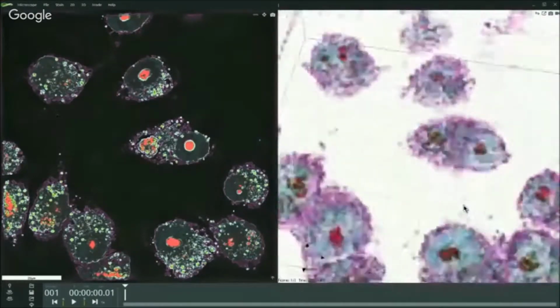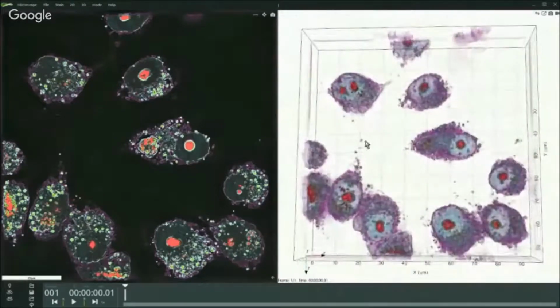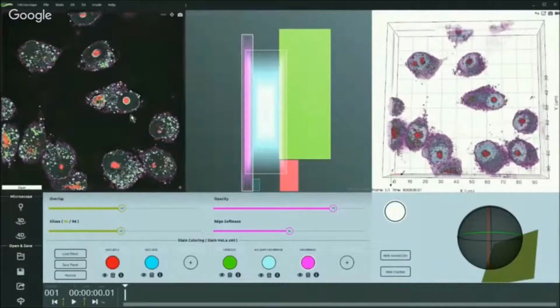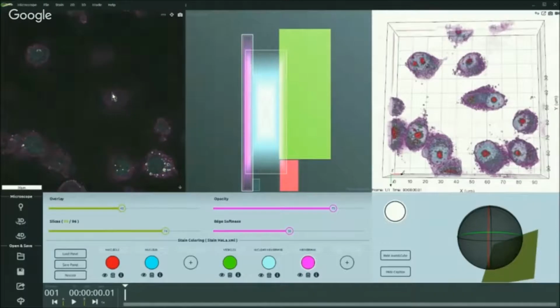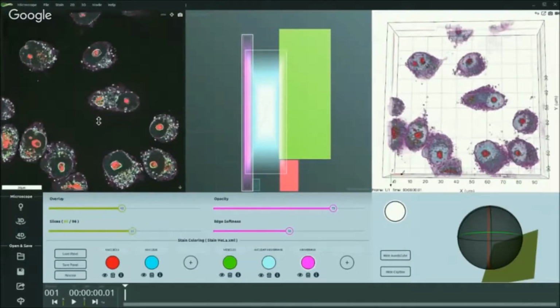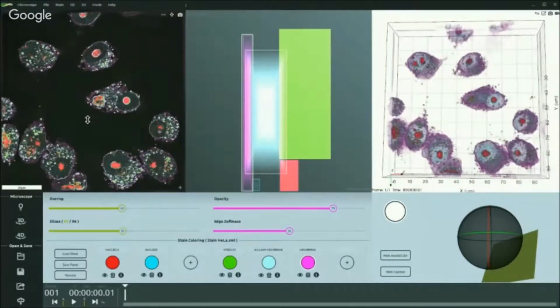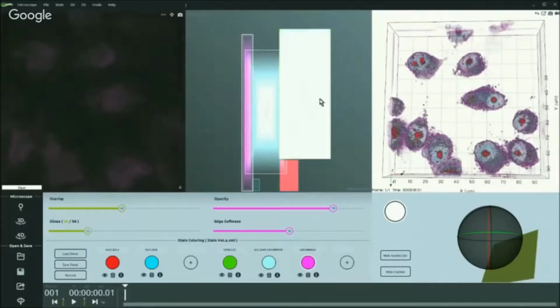So, for instance, if you are interested in the membrane, you can select your region for the membrane. We have this marking here, and you can really appreciate it moving through the cell. So I'm here at the top of the cell. You see the membrane is closed on the top, and then you go down. It moves slightly to the borders, goes down, down, down. We are at the cross section of the cell. The membrane is all outside, and then we go down, down, and we go through the cell, and the membrane closes at the bottom. This is just amazing.